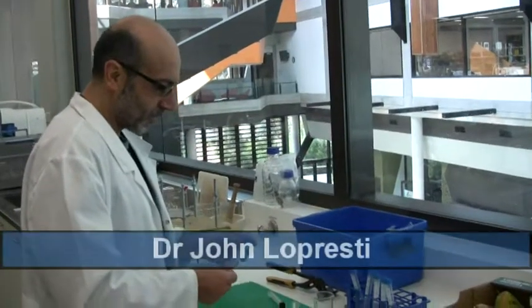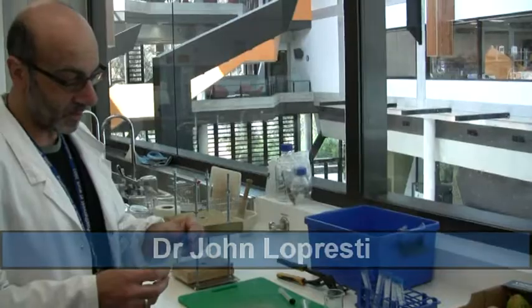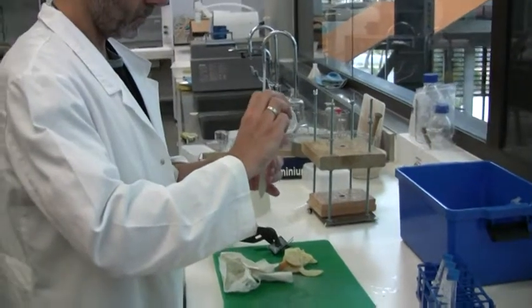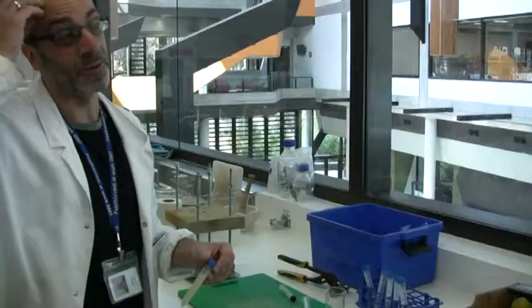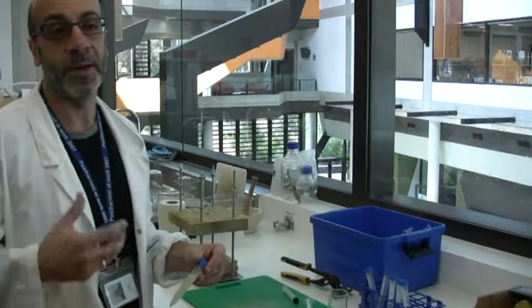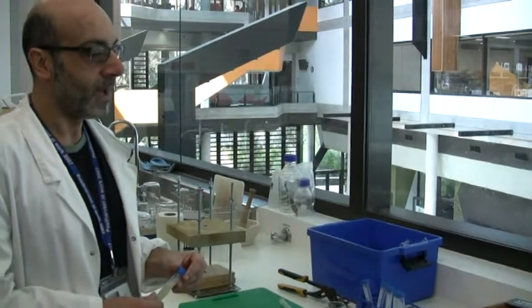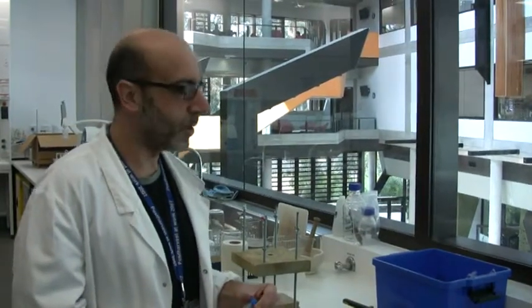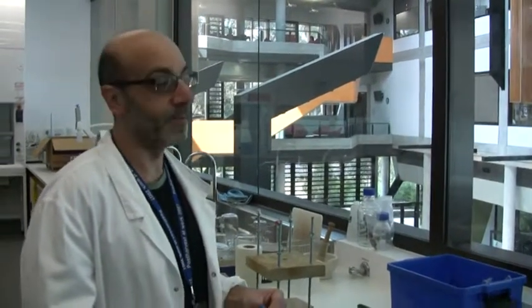So the 2 measurements we're taking at the moment is we're taking juice samples for titratable acidity measurement, which we then use with soluble solids to get an idea of the sugar-acid ratio and then eating quality. And the next measurement we're going to do is expressible juice, and that basically gives us an idea of, again, eating quality, but texture-wise, so how mealy the fruit is out of storage, for example. So it tries to replicate the mouthfeel of the fruit when you're eating it. So we get an idea of how much juice actually comes out of the fruit, and again it's an indicator of eating quality.